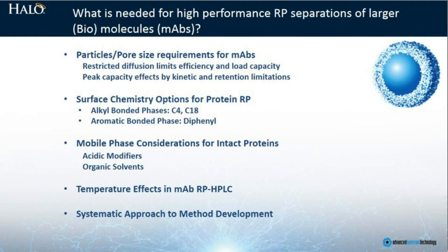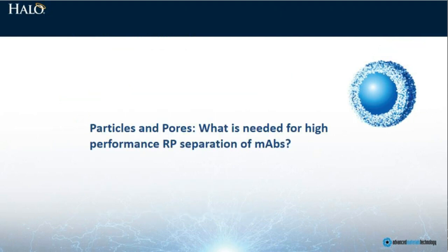As we get to the end of the presentation today, I will share with you some laboratory approaches that we've developed and have found useful to systematize the method development that we've used for monoclonal antibody separation. And it uses the combination of these variables that we've just discussed.